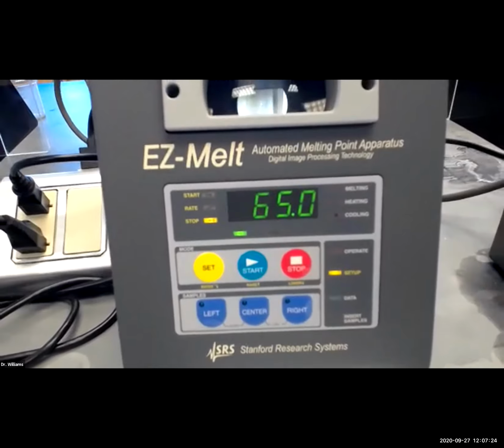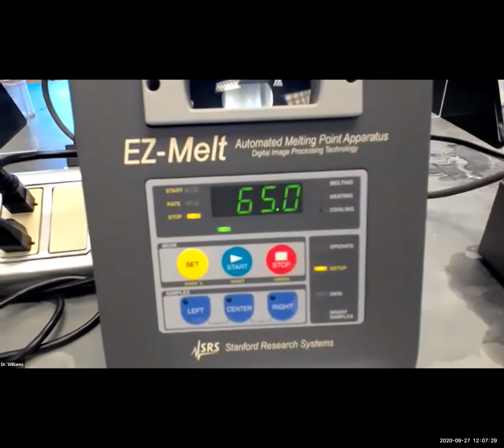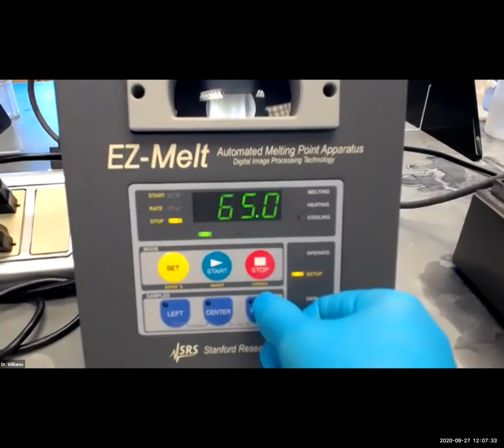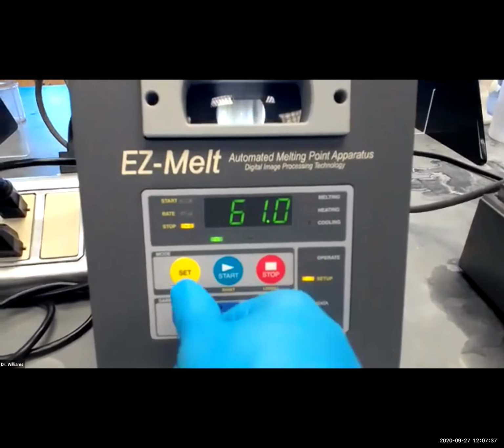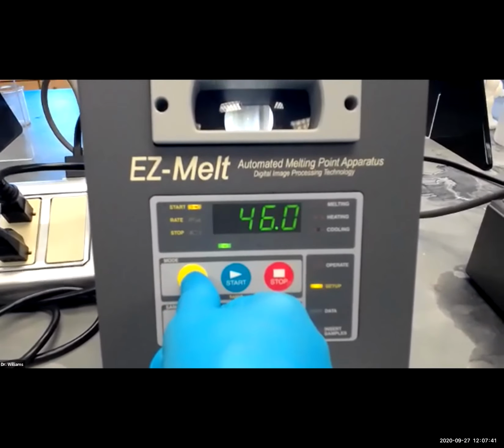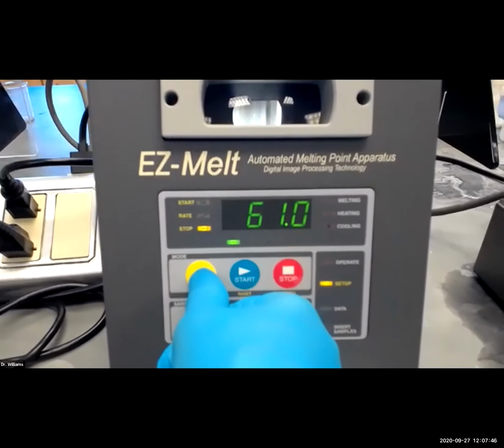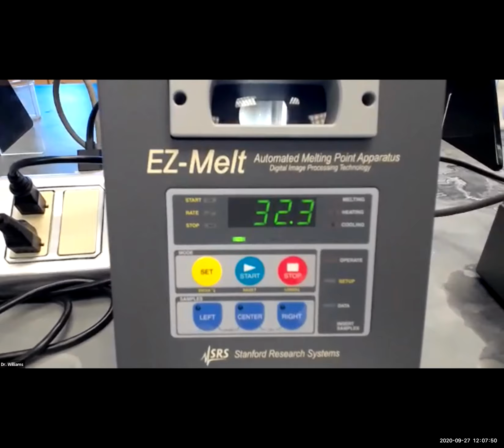The stop temperature, 65. This said, what, 56? So that should be 61. So start temperature was 46. Rate is a degree per minute. Stop is 61. Looks good. Now we're ready to make up the sample.